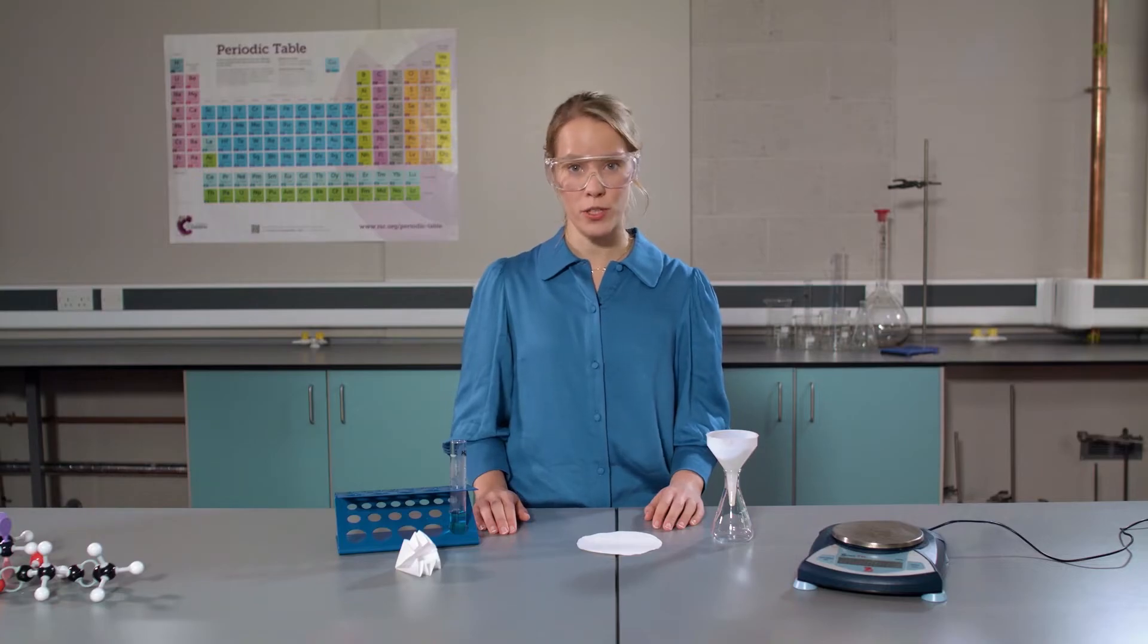In this next step, we're going to separate the product, copper sulfate, from the unreacted reactant, copper oxide, using filtration. We will be using fluted filter paper.